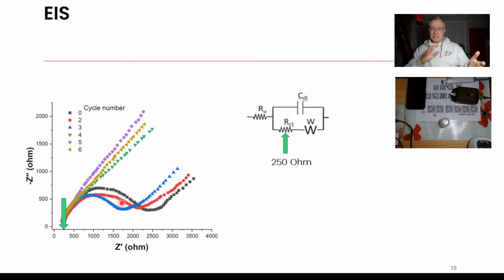So I'm not saying it's super small in this particular case, but actually within our own data, we've often got a lot bigger charge transfer resistance. So the solution resistance is actually sort of minuscule compared, let's say, to the total resistance of the electrochemical cell. So in order to answer this person's question, the original question was, if you've got a potentiostat and it's got compensation, why do you still have a solution resistance? And it's because there's still a small amount of solution between the reference electrode and working electrode, and we're actually dropping some voltage over that resistor.